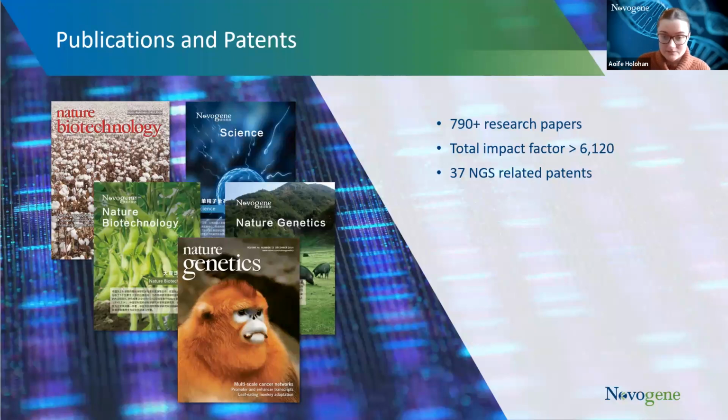The benefits of our in-house innovation are clear in our record in the scientific community, which we're very proud of. We've been cited in over 790 research papers with a total impact factor of over 6,120. And we're also driving the NGS industry forward with over 37 NGS-related patents. Our technology is helping to make the NGS process more efficient and effective, all the while improving the quality of the data that we deliver.